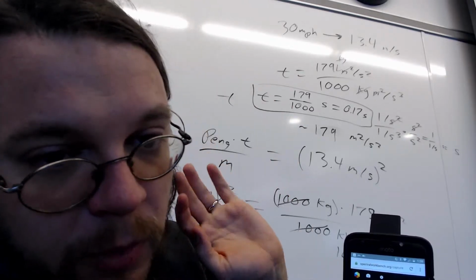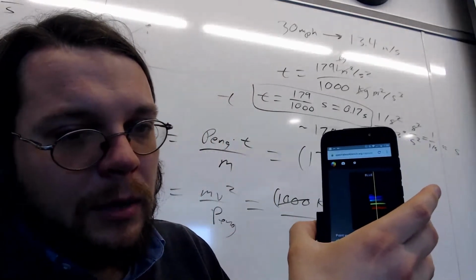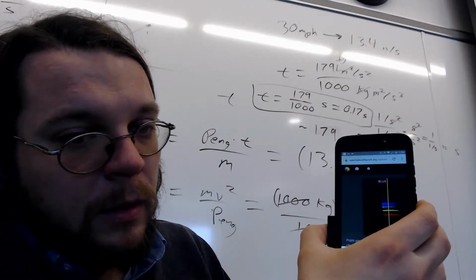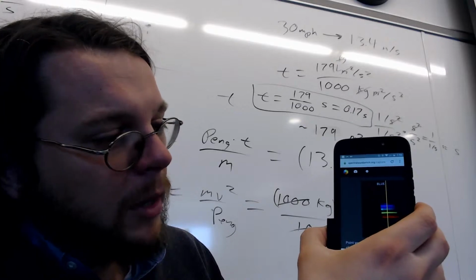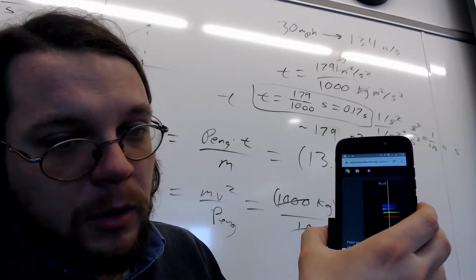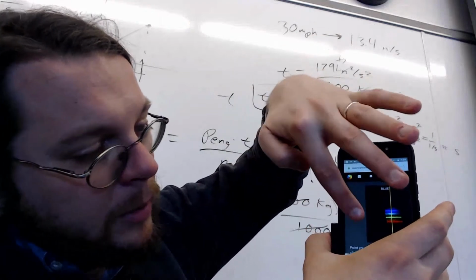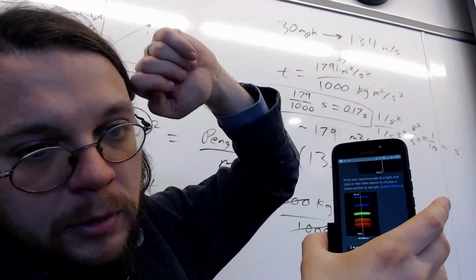And by the way, you don't want to point this thing exactly at the fluorescent lights, because that will saturate and it'll look too bright, and you won't get good data out of that because the pixels will be maxed out. So there you go. It should look like that. It should have blue on the top and red on the bottom. And so you can see that this looks a lot like their example that's there.